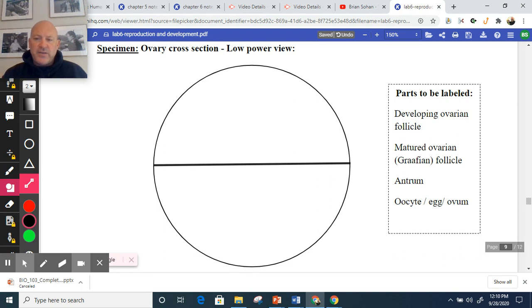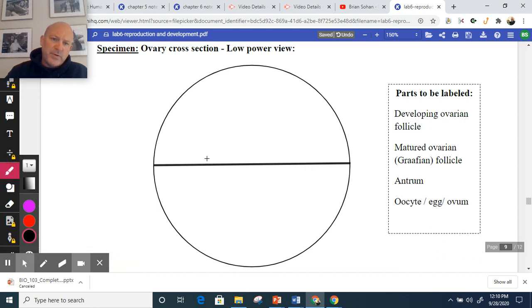So as magnification decreases, the field diameter increases, right? So we're decreasing magnification, so we have to increase field diameter. So it's going to increase, actually. This is from week 1 when we established these. It's going to go from 450 micrometers. Now we're looking at 1,800 micrometers across.